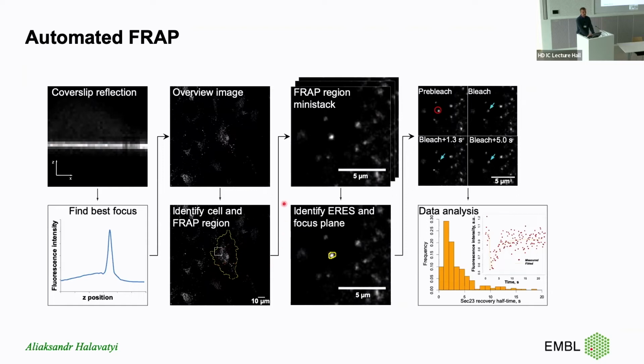Then the microscope focuses on the region of interest and briefly acquires this tag. In this case, because we are already at the right place with our stage, the communication can be really fast. As soon as we know the target structure, we can, within a sub-second range, trigger our bleaching experiment by targeting the right structure and acquire such data in a high-throughput manner, right? So at the end, in overnight experiments, we were able to collect hundreds of such recovery curves.